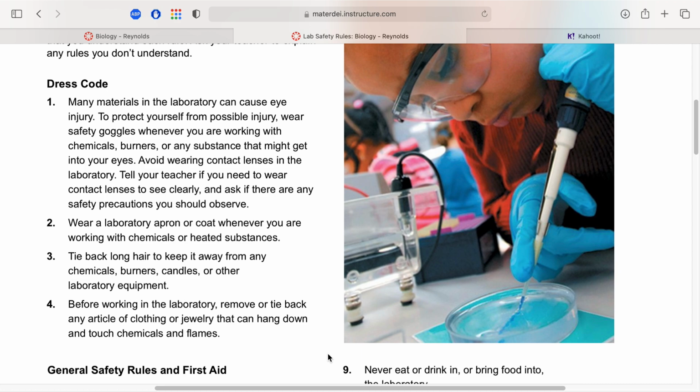When you're filling something up, like a container, and you're asked to get so much and you go, oh, I did too much, I better pour some back. Never pour liquids back into the container that they came from. This jar, you expect it to be clean, but maybe it's not. Maybe it's got some powder that now is dissolved in here, and so now this isn't pure anymore if you were to pour it back in there. So we'll have a place for you to do over pour, or maybe you can just help out your neighbor if they still need that.